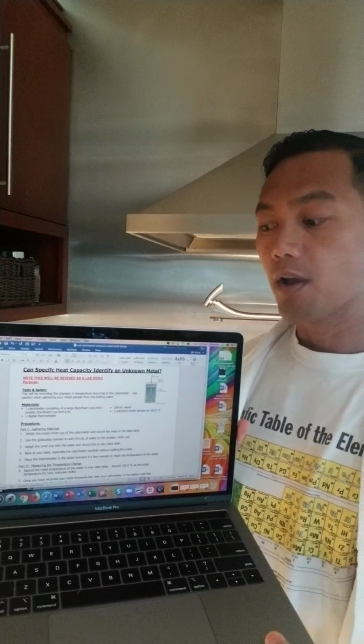Hi everyone, we're going to be doing a lab today about the specific heat capacity of unknown metals using the calorimetry technique. And I'm wearing our periodic table chart for today. So a few things that you're going to need. Make sure that you have already previewed on the Google Classroom so you can download the PDF or the Word doc version of our lab report. It's fairly short, and I'll go through the procedure as quickly as possible.